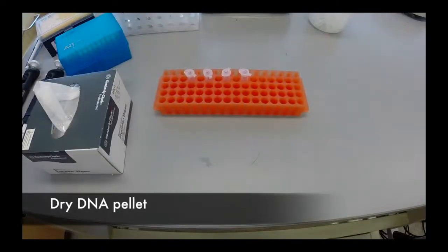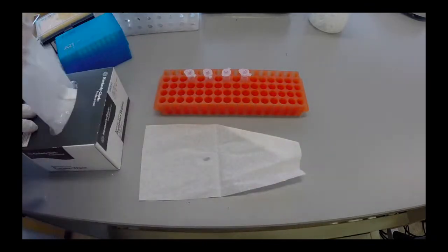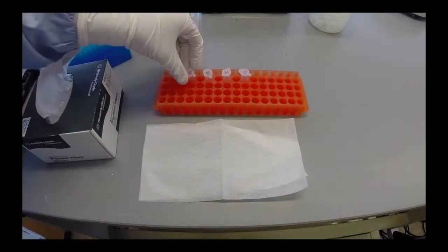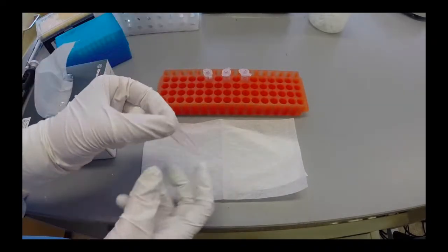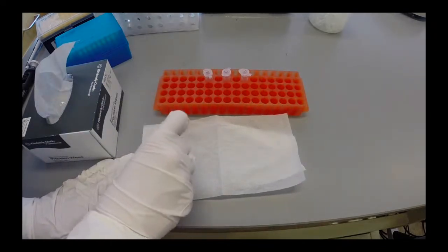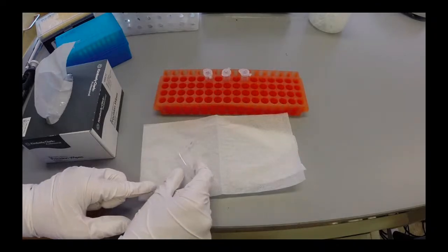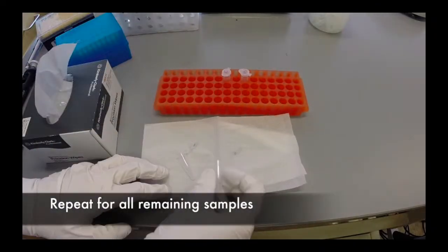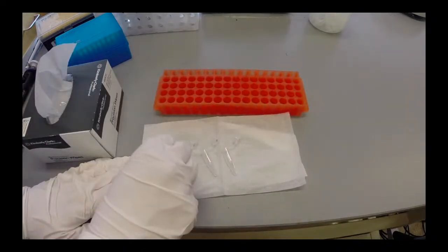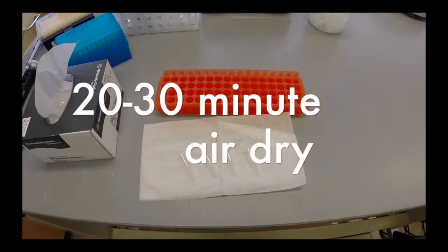Lay out a few layers of Kim wipes. Open the tube and knock it onto the Kim wipe to remove any large volumes of solution still remaining. Leave the tube open and lay it on its side to evaporate any of the remaining solution from the pellet. Repeat this process for all remaining samples and allow them to air dry for 20 to 30 minutes.